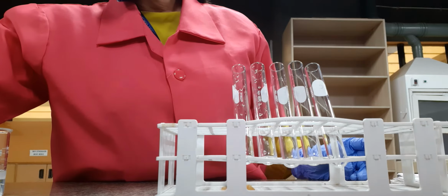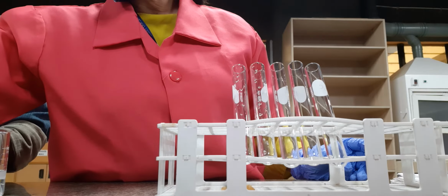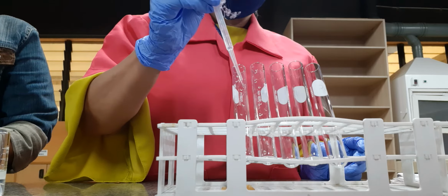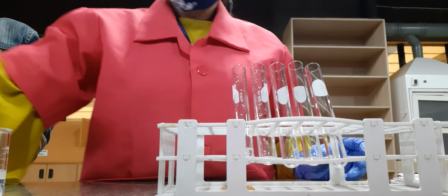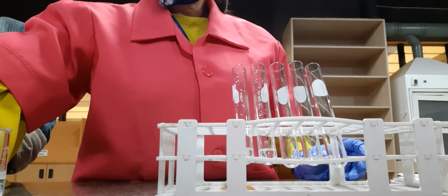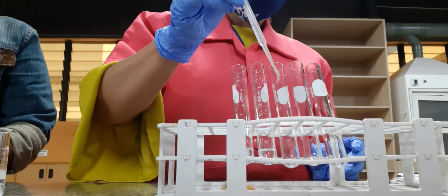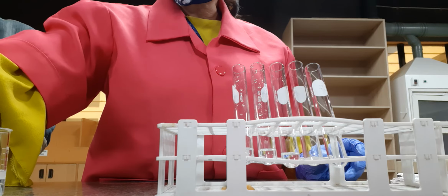So we'll have 1 ml each of our substance. We have the third test tube. We have acetone.